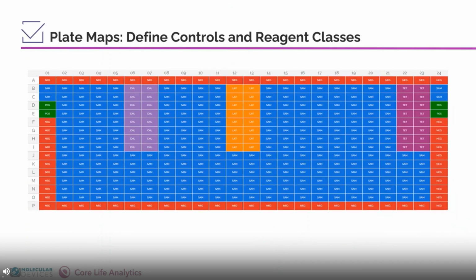After removing the redundancy in the data, it is also critical to be able to create a plate map for your experiment, where you can assign specific values to your treatment groups, for example, where the negative and positive controls are, and where the compounds of interest are located. This extra layer of metadata information will be useful downstream of your analysis process, where you can track things as you go through the data analysis workflow.